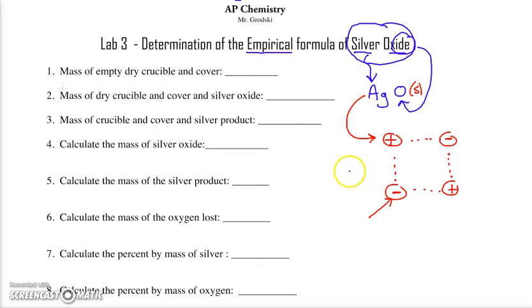So what we've got to do is apply heat to pull these negative ions, which are electrostatically attracted to the positives, these silvers, which tend to be pretty small, out of those positions. And then of course it's a redox reaction to make elemental oxygen, and the silver would become silver zero, or elemental silver. So we're going to have a redox reaction going on, and it's not important that you totally get that, but you should understand that we're dealing with silver plus in the crystal, and it's becoming silver zero.